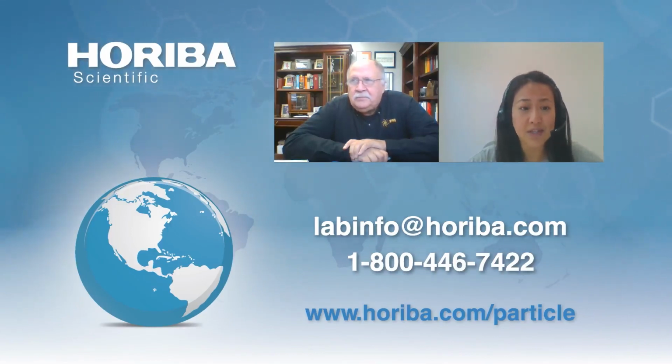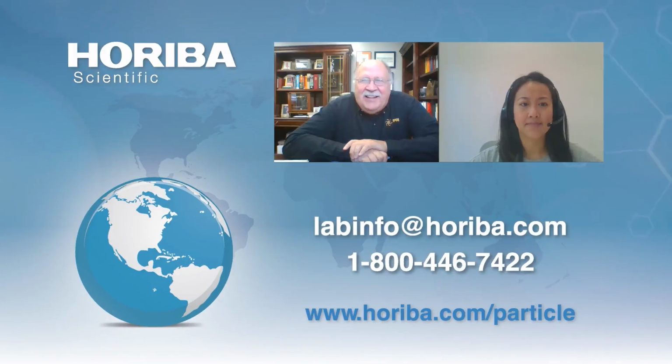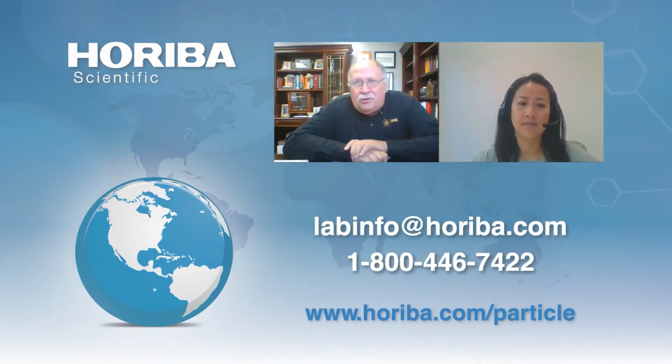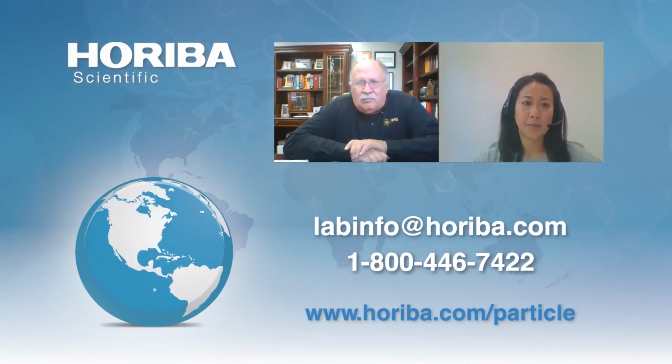The next question is, what are the benefits of implementing particle size analysis in the sugar refining industry? Wow, since that's a crystallization technique, if you wanted to optimize that, I would sure like to know what your crystallization agent size is. Was it calcium oxide that they put in to crystallize sugar? Knowing that size could be very important. And knowing the size distribution of the crystals as they crystallize could be incredibly important. So I would be measuring particle size all over the place in that plant.